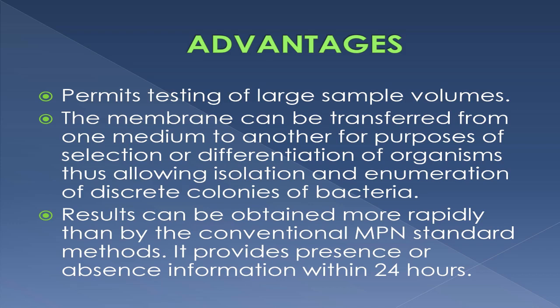Results can be obtained more rapidly than with the conventional standard method. It provides presence or absence information within 24 hours.